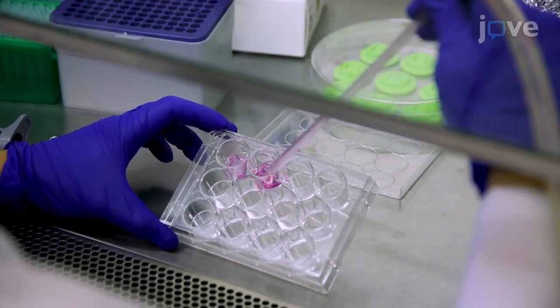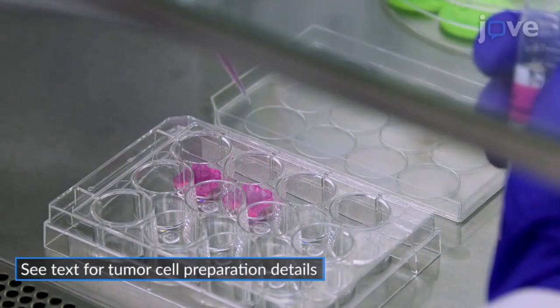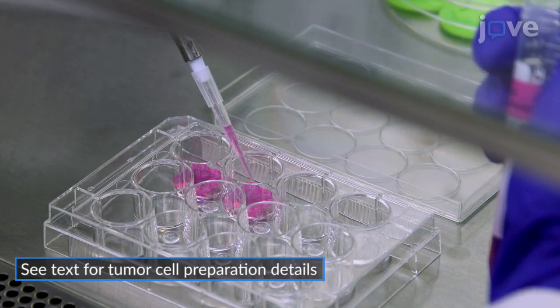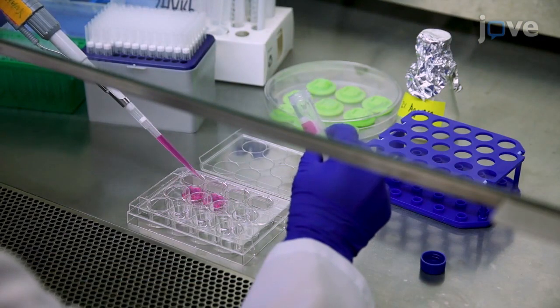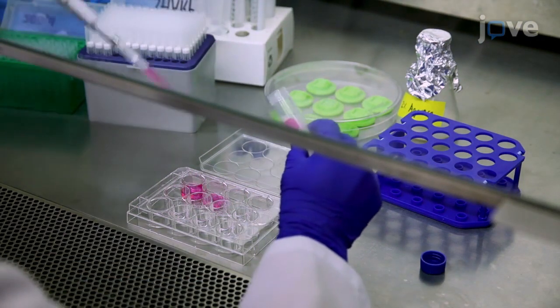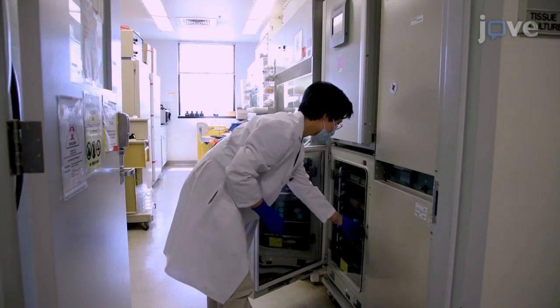At the end of the incubation, tilt the plate to remove the cell culture medium in the surrounding first, then in the seeding chamber, and carefully seed 190 microliters of the prepared tumor cell suspension drop-wise into each cell seeding chamber. After a 15-minute incubation in the cell culture incubator, add 2.5 milliliters of medium to the outside of the cast, and return the plate to the incubator for 48 hours.